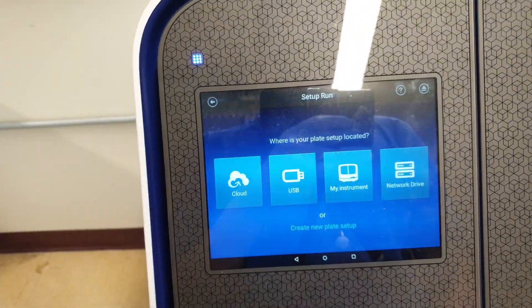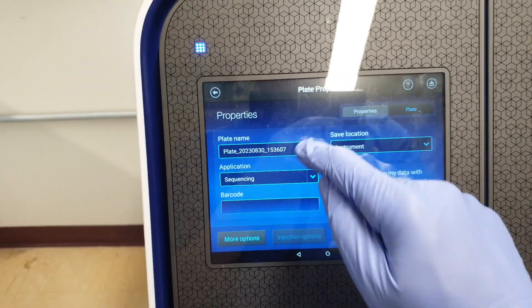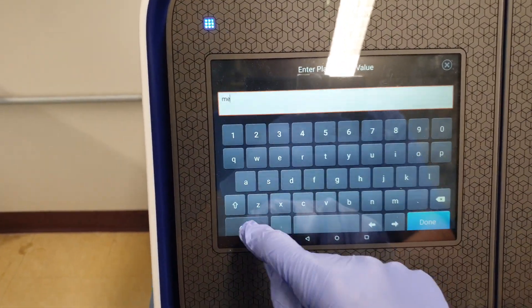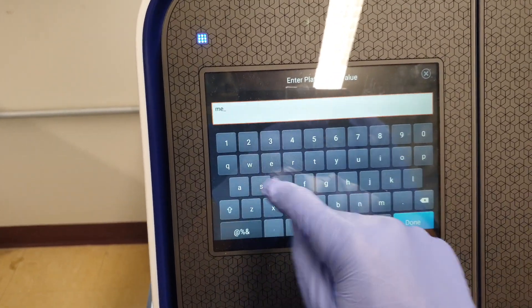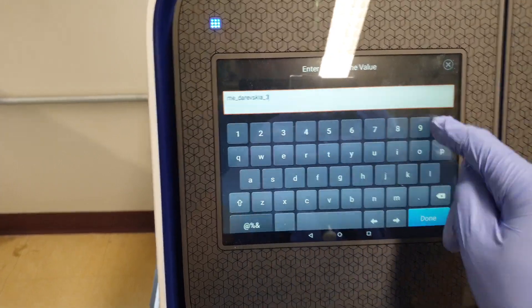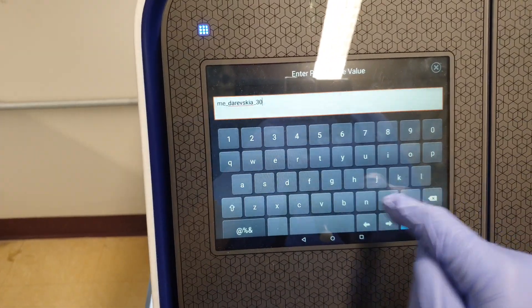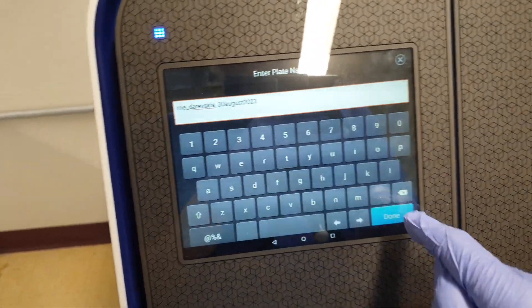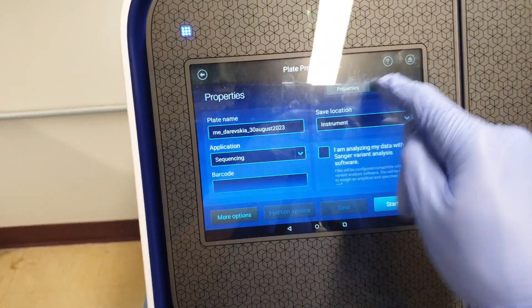Click on Setup Run. Create new plate setup. I'm going to name this with my initials. Done. Plate.